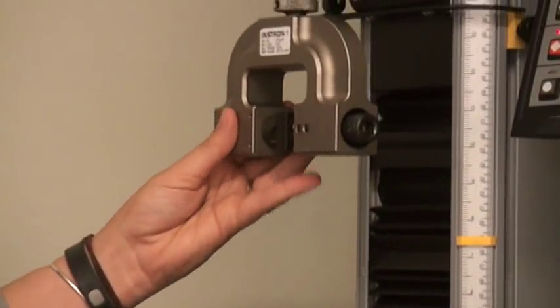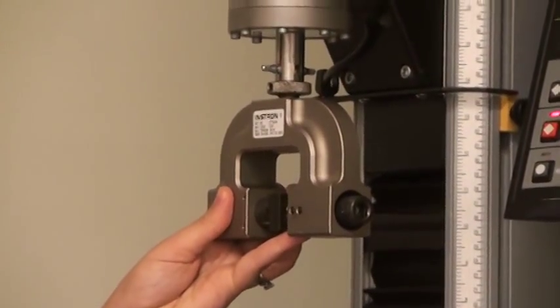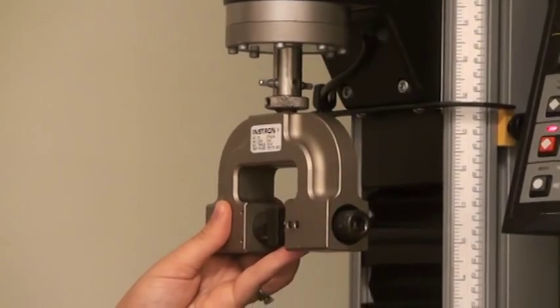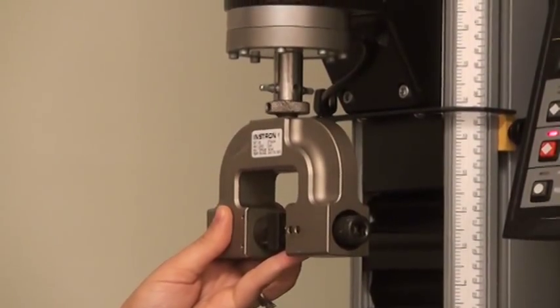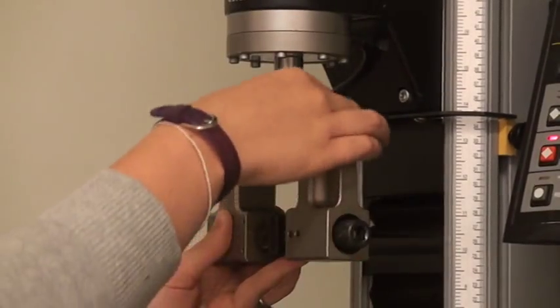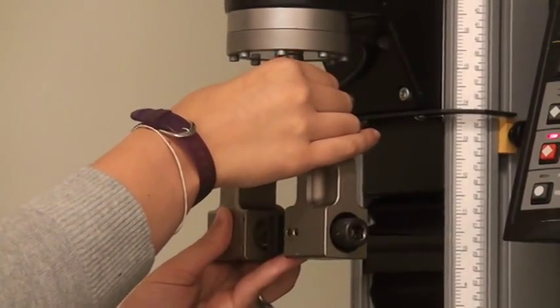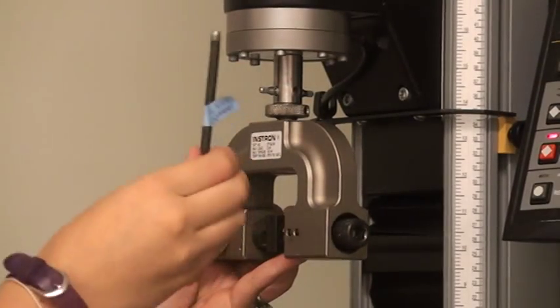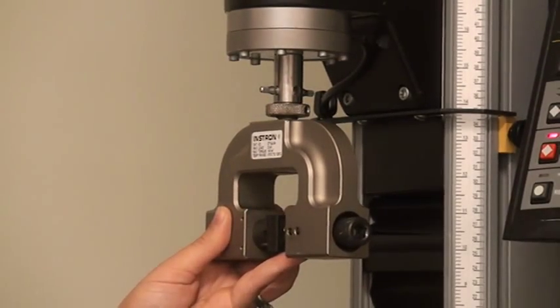While removing the upper grip, you should always keep one hand securely holding the grip to prevent it from falling and causing damage to the equipment or yourself. Loosen the upper lock nut by turning clockwise until it is stopped by the top face of the grip. Use the lock nut tightening tool if it is very tight.